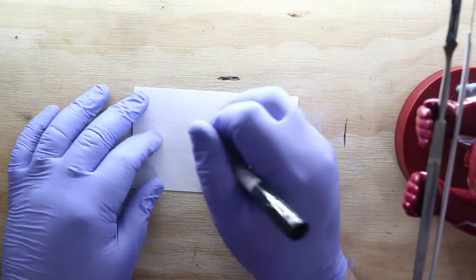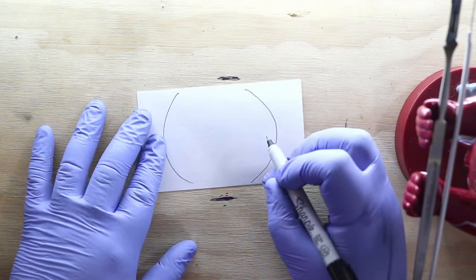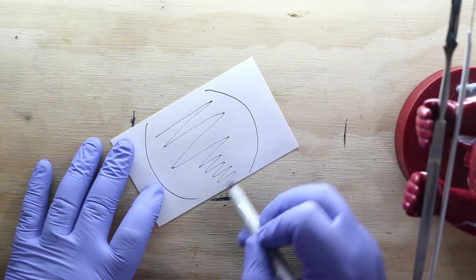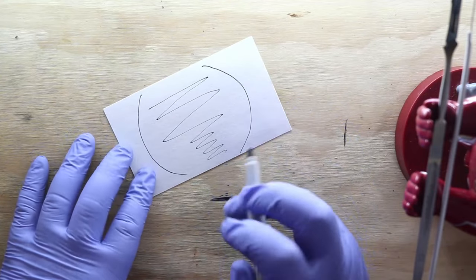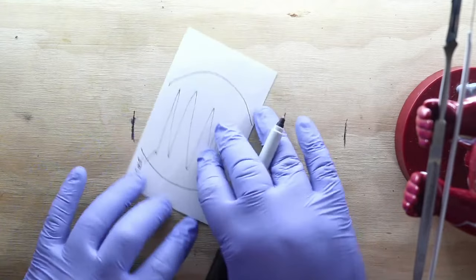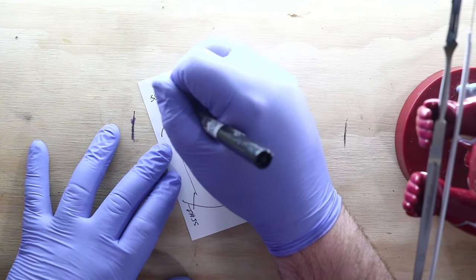So here's your dish. We're just going to use a single compartment dish instead of the threes, just for simplicity's sake. When you do a spore streak, you go wide, and then you start doing it like that. That's spore streak number one. I would then rotate my dish about 90 degrees and do spore streak number two.